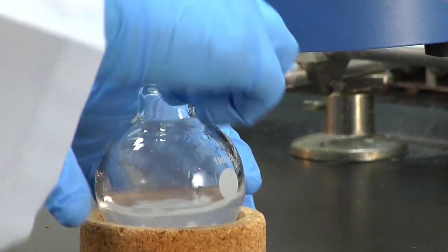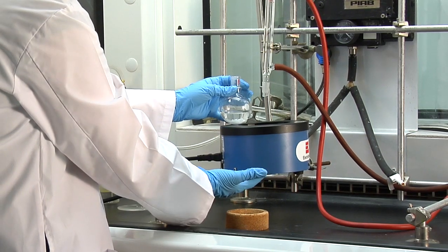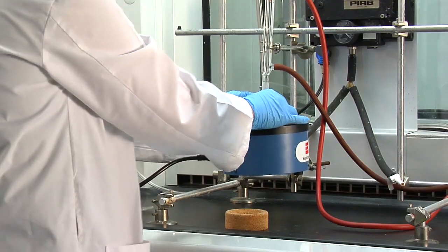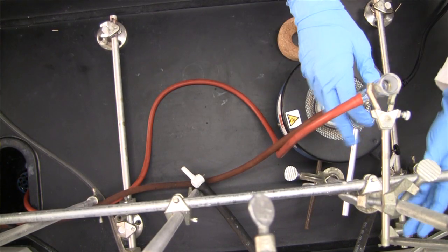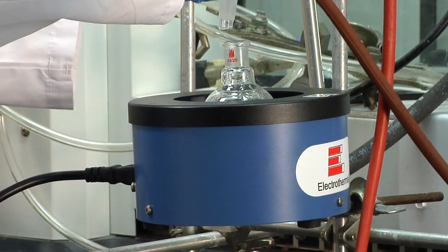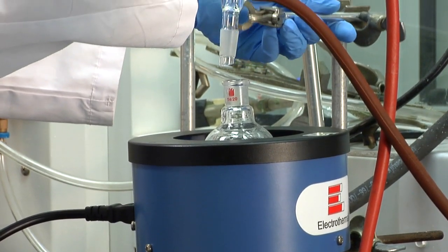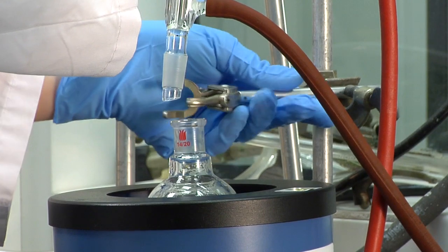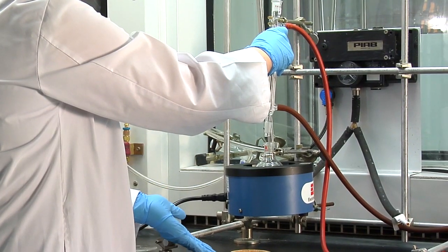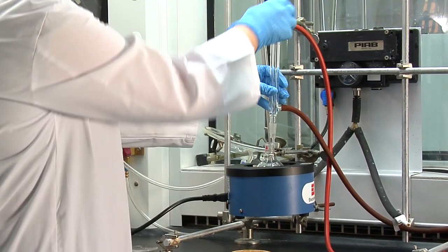Give that a little swirl, and we're going to put this in here. Make sure you've set up your heating mantle on a ring clamp so that you can drop the heat if the reaction gets out of control or starts bubbling a little too much. So we're just going to lower our condenser now onto here, and we're actually going to replace this clamp onto the round bottom flask here because you want your clamp to be right here, just in case you have to drop the heat. You don't want to drop the heat and have the round bottom flask fall out the bottom.